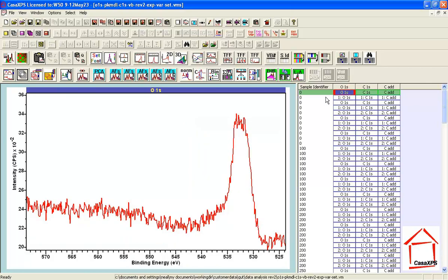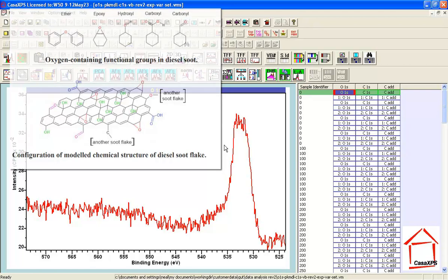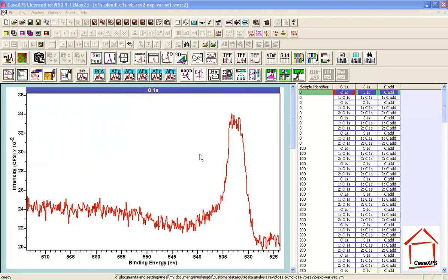It's not easy to understand from the Oxygen 1S either, but nevertheless we ought to see some kind of changes as we heat this sample that might give us a clue as to the type of peaks that ought to be in these data. Just presented with these data, we might assume that we've got maybe two or three peaks contributing.